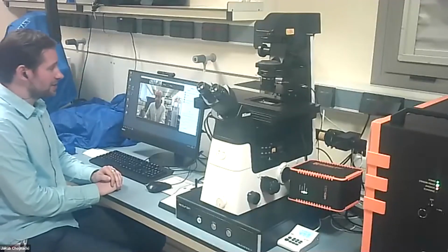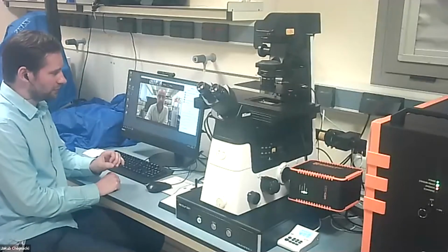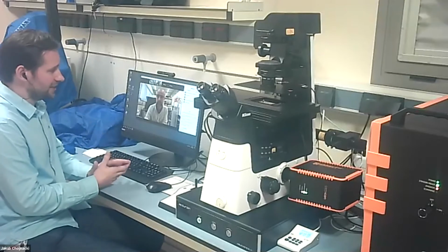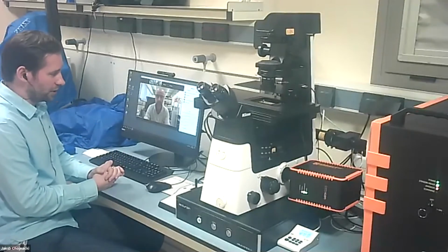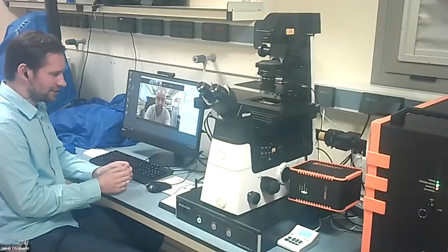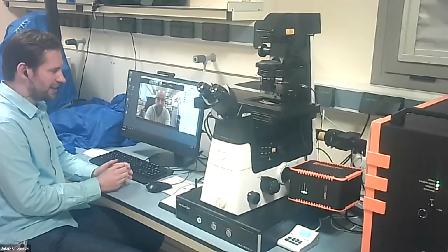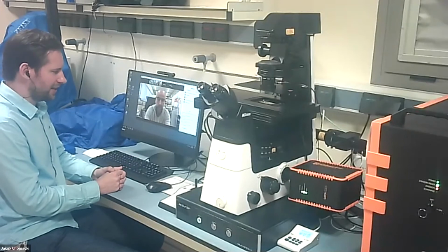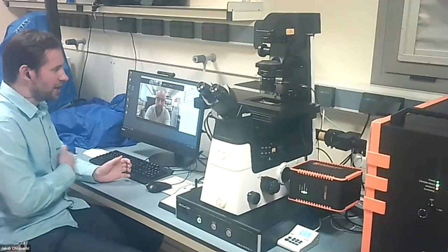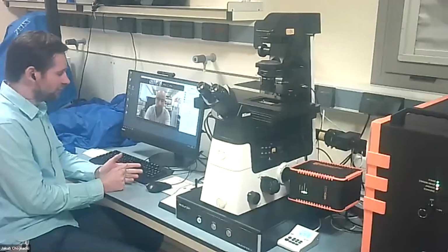Definitely. Actually, this is one of the big fields right now. It's called CLEM, correlative light and electron microscopy, and precisely, it does what you were saying. It takes exactly the same image and exactly the same part of the cell or part of the virus, and images it first using a fluorescence microscope, and then images it using an electron microscope, and correlates it with fluorescence microscopy.